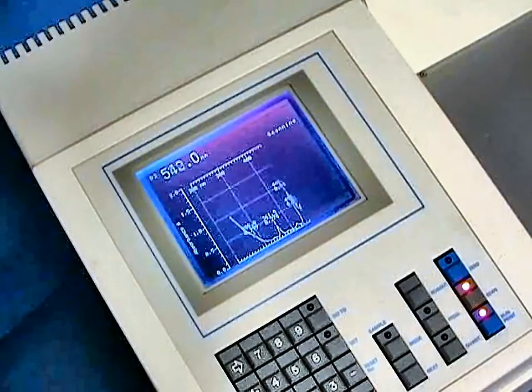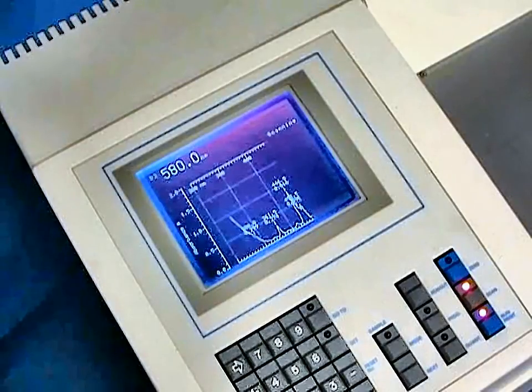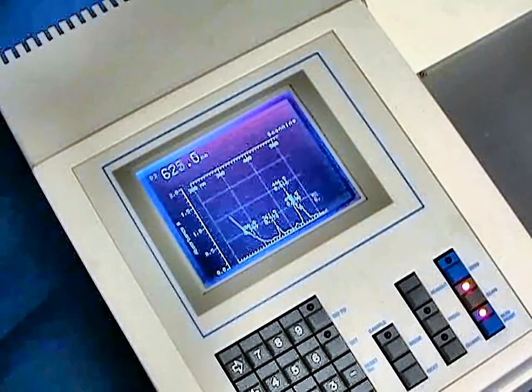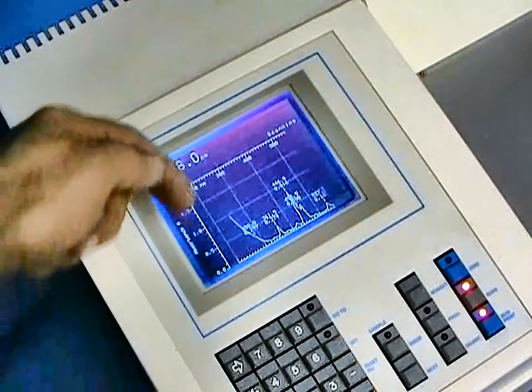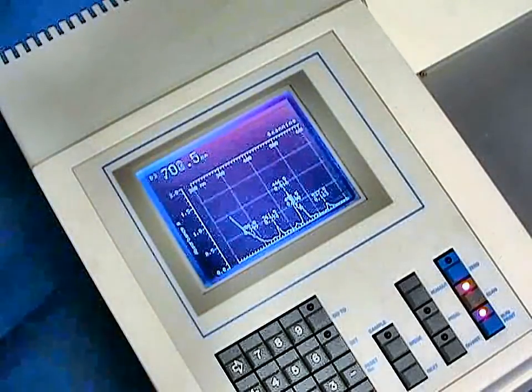After the scan is completed, we can direct this to the small internal printer, an external printer, or via software on a PC with our optional software packages. The on-screen display also includes a peak pick identifying the lambda max of all of the peaks displayed on the screen.